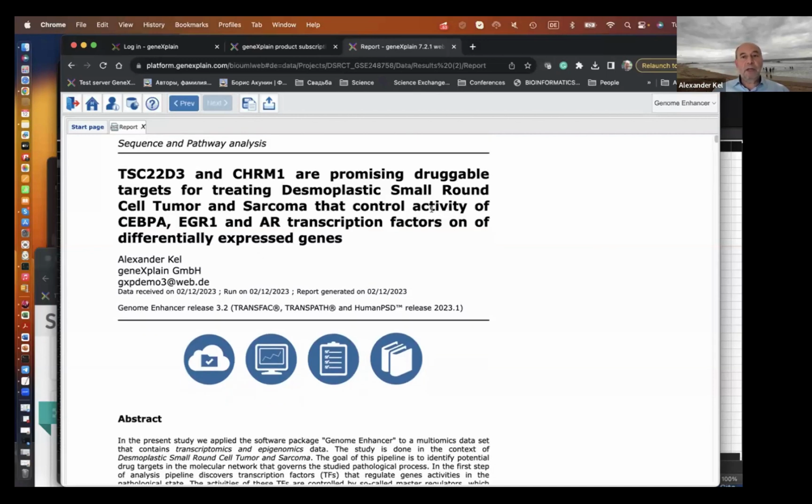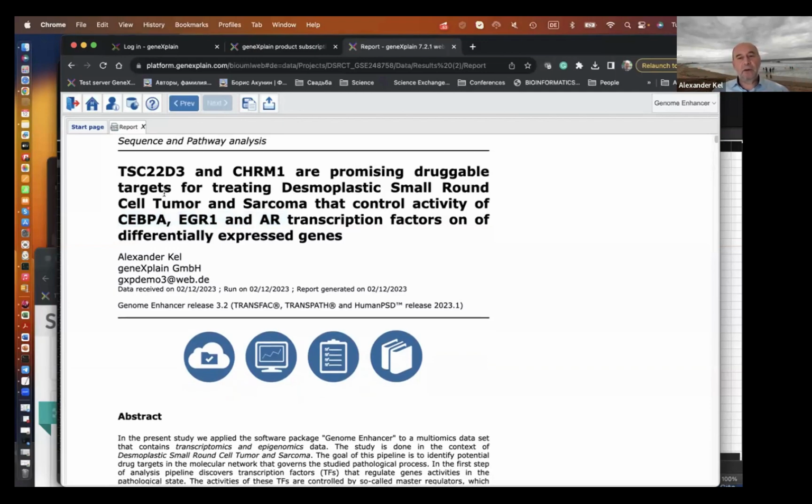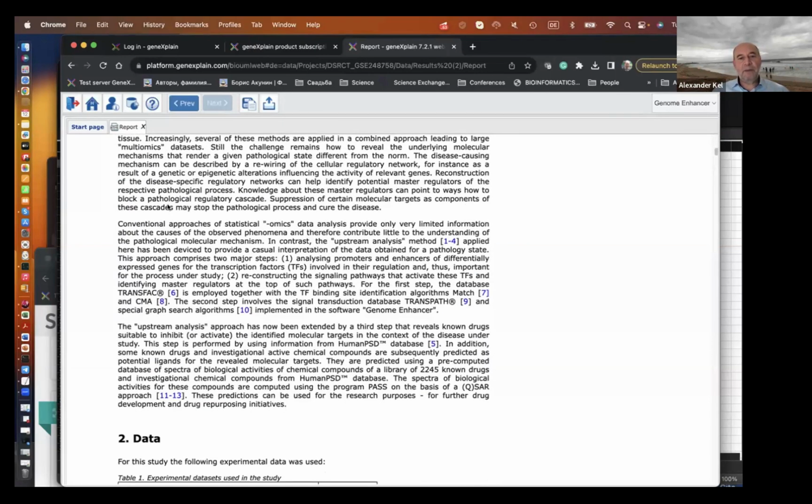All right. And then it reports which transcription factor motifs are enriched in those regions, and selects these 3, for instance, as the most important, interesting factors, and then it goes upstream and finds master regulators. Let's have a look at exactly what it's doing.